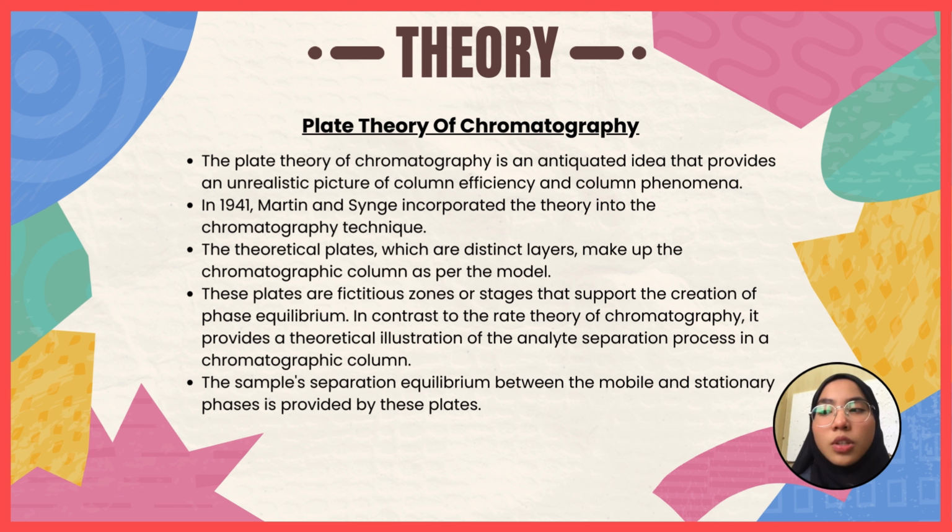These plates are fictitious zones or stages that support the creation of phase equilibrium. In contrast to the rate theory of chromatography, it provides a theoretical illustration of the analyte separation process in a chromatographic column.